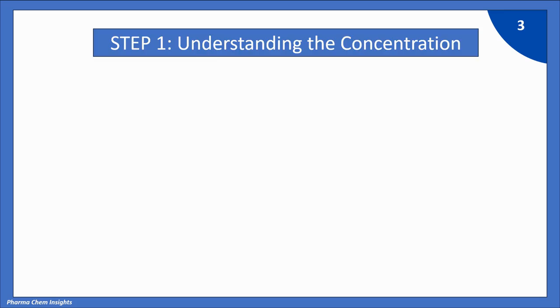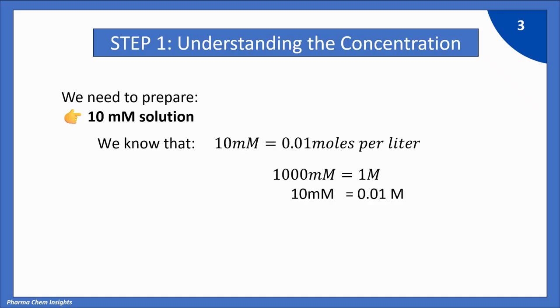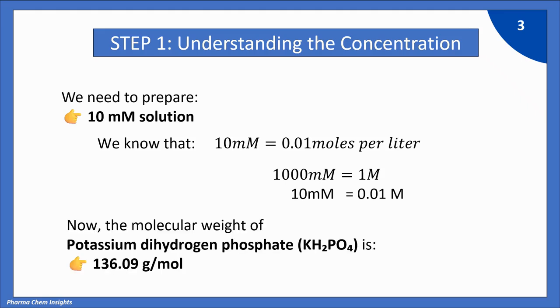Understanding the concentration. We need to prepare 10 millimolar solution. So we know that 10 millimolar is equal to 0.01 moles per liter. That is, 1000 millimolar is equal to 1 molar. So 10 millimolar is equal to 0.01 molar.